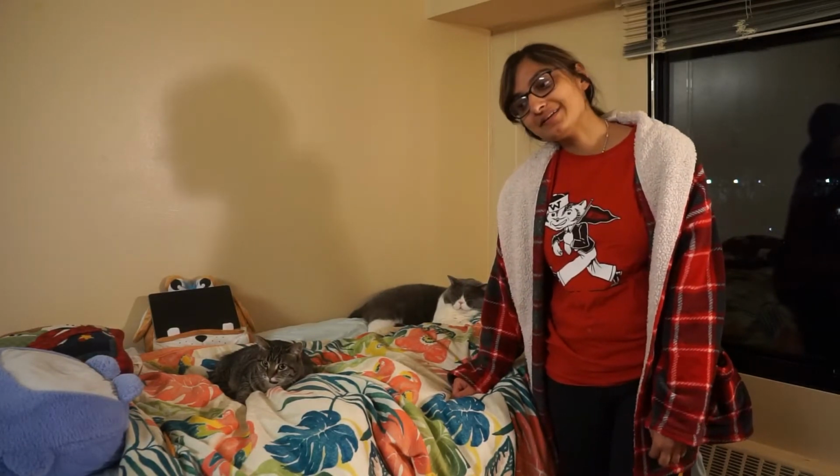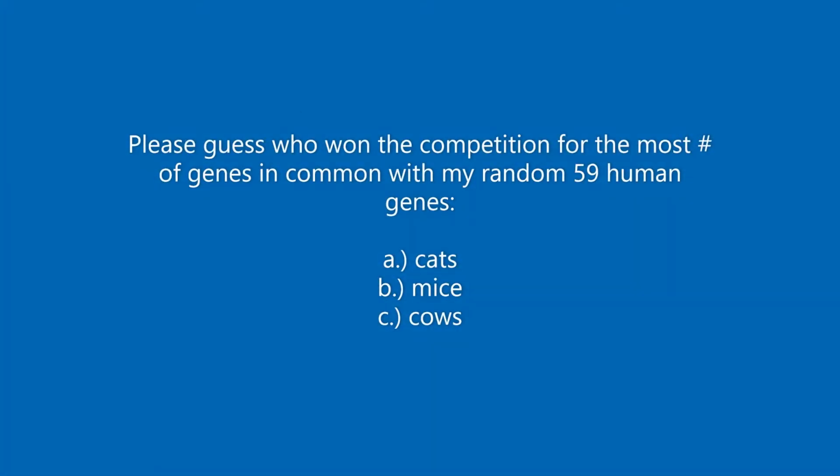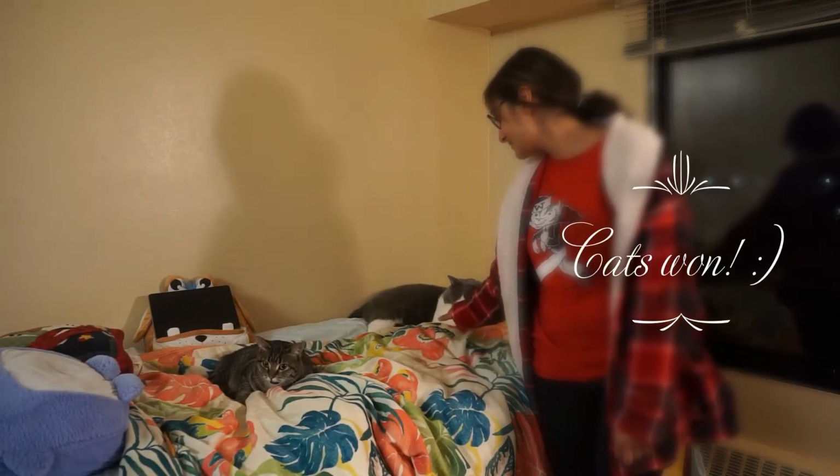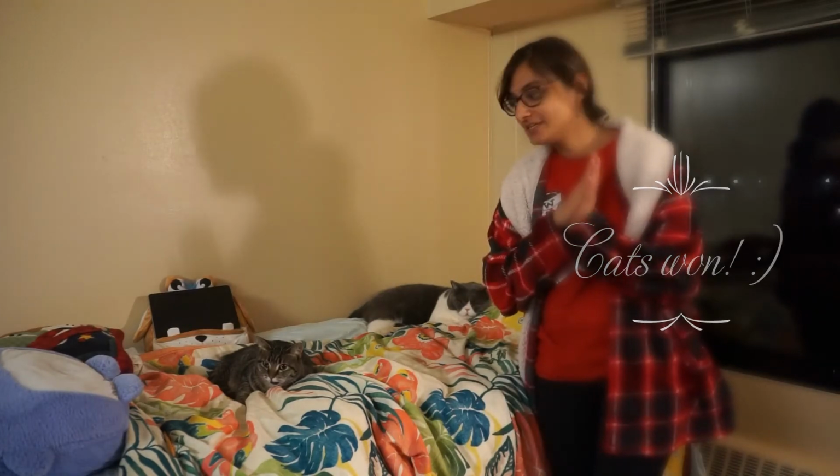And we had a winner, and the winner was cats. Cats had the most number of genes that mapped between our list of human genes and the list of cat genes as well, out of the 59 that I input.